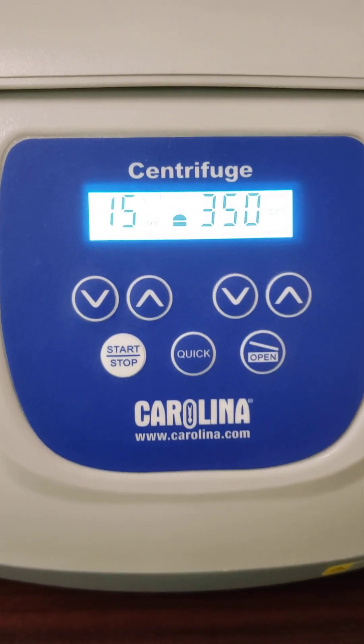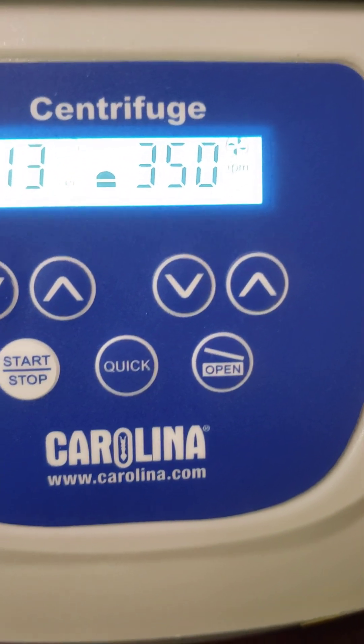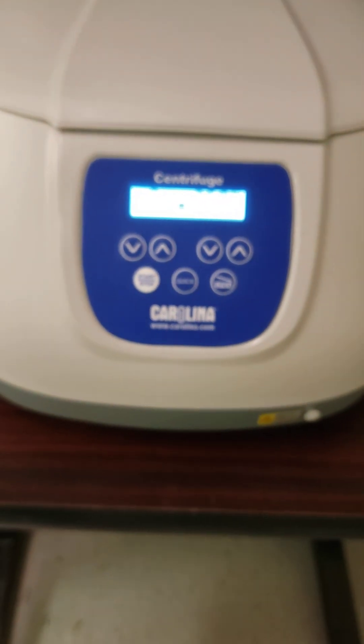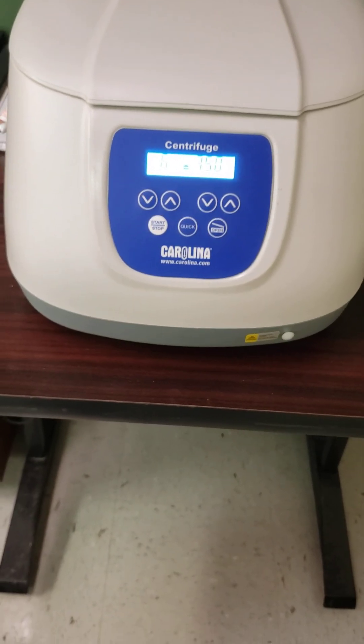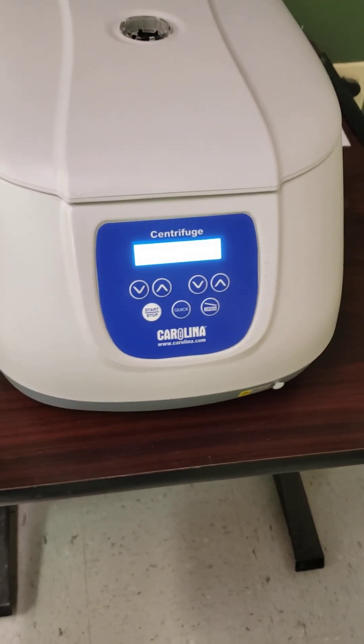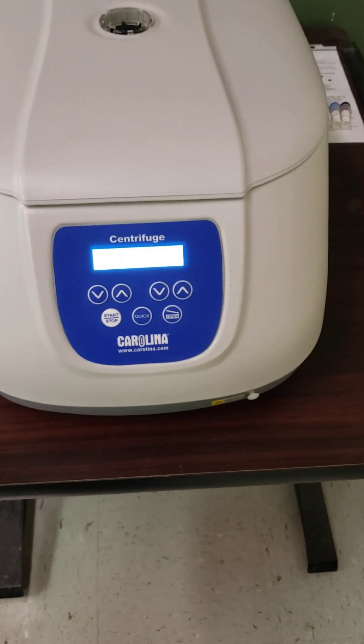We're up to 350 rpm right now. In the past, I had my students pack these for what seemed like forever, like a pack of cigarettes, which may not be a good analogy.